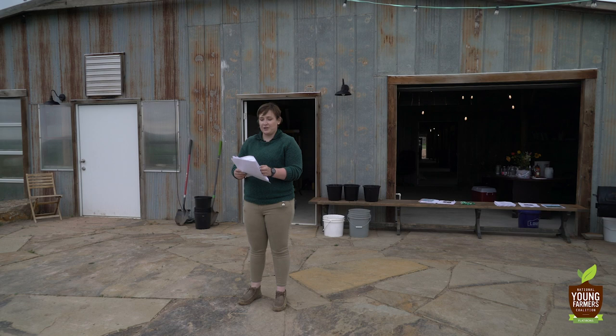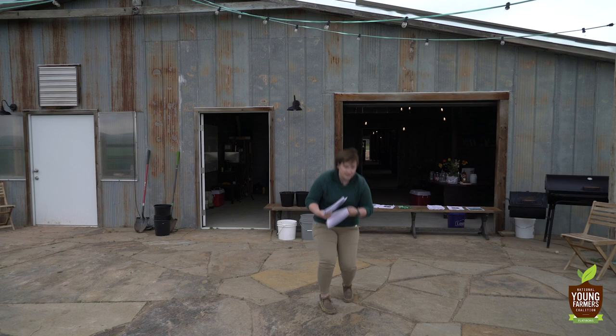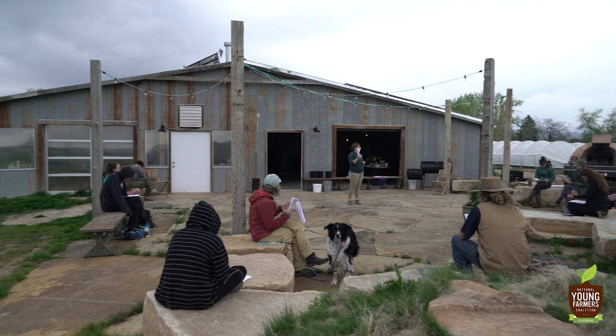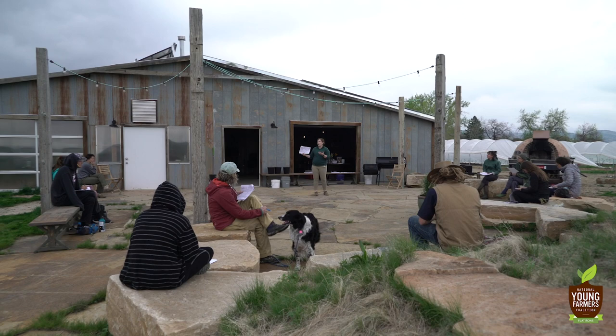So if you guys flip over two sheets to the one that says Regen Ag on the front, this is an example of the soil health Haney test. This will get into that question about total carbon and total organic carbon. The Haney test is a different extraction method than our traditional soil fertility tests. And the Haney test was really developed to use a whole suite of different factors to give you a rating of your overall soil health.